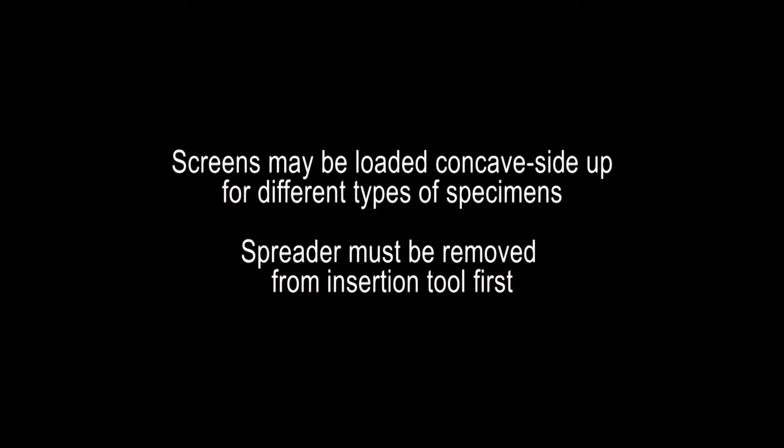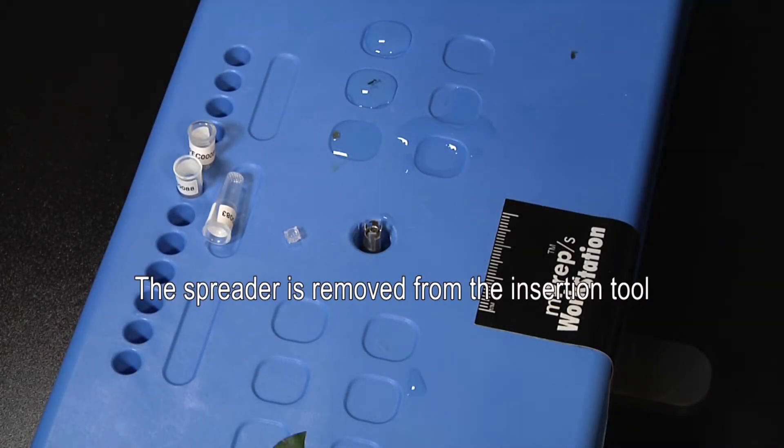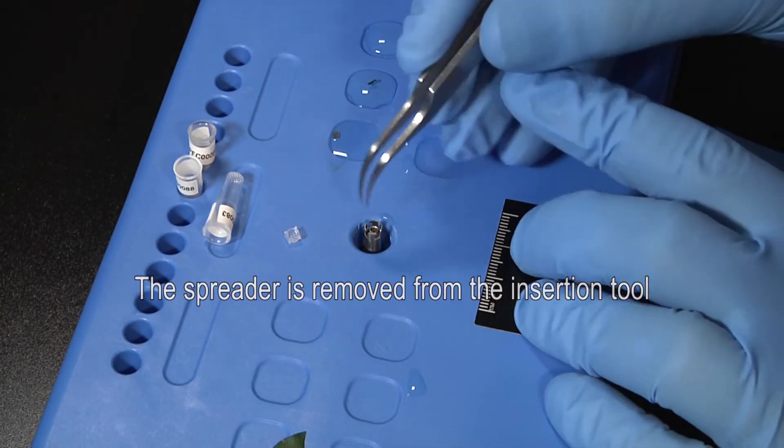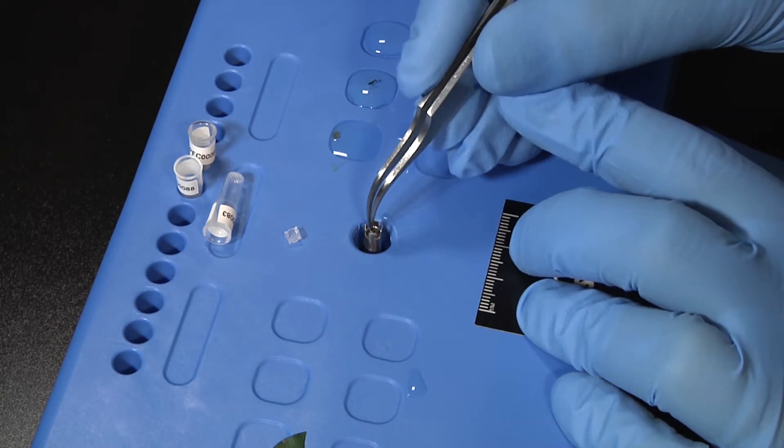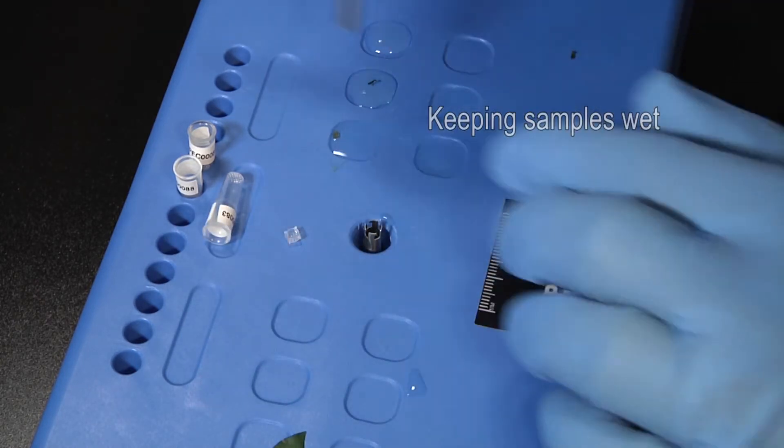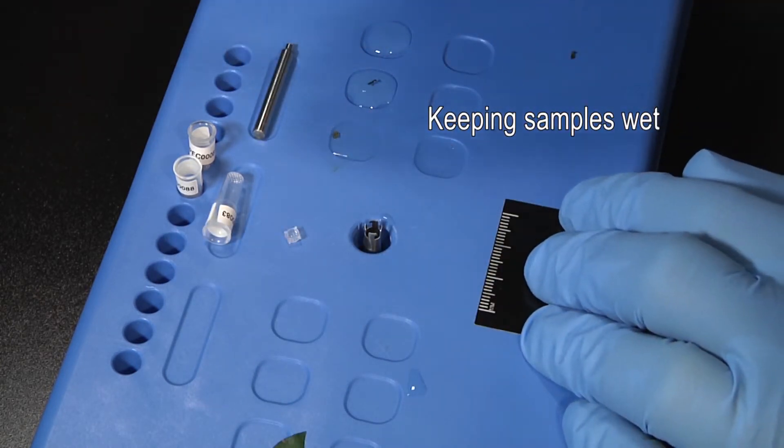A third way to load specimens is to use the concave side of the screen. To do so, the spreader rod must first be removed. This is done by simply lifting it out and setting it aside. This example also shows that samples can be easily kept wet with buffer or fixative during processing.